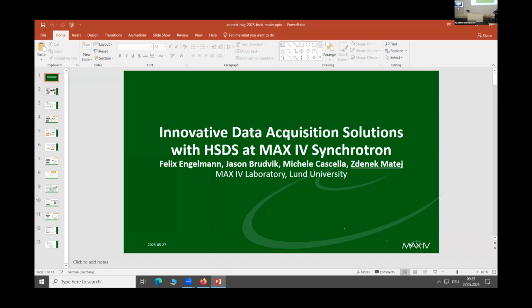Our H5 dictionary helper in dtranspose is allowing concurrent access. And there's one more question online from Sonal Patel. If you could unmute yourself. Hello. Yes. At the beginning of your slides, you mentioned Nexus. I just wanted to ask, where does Nexus come into the acquisition workflow? Is it directly acquired in the Nexus standard, or do you convert in between after the acquisition?